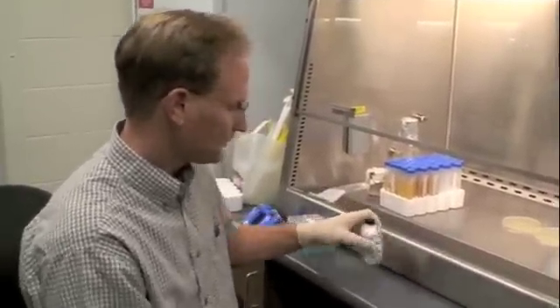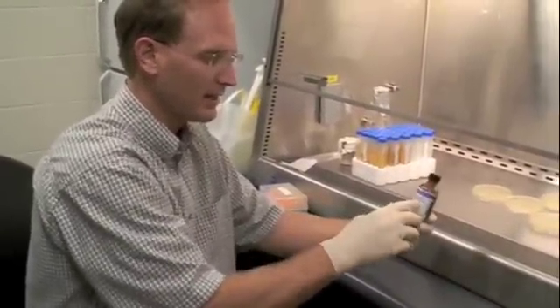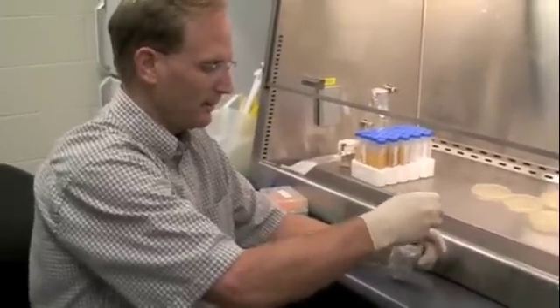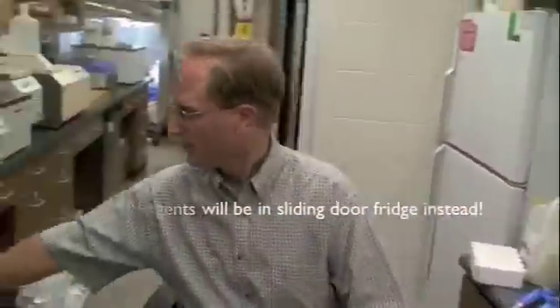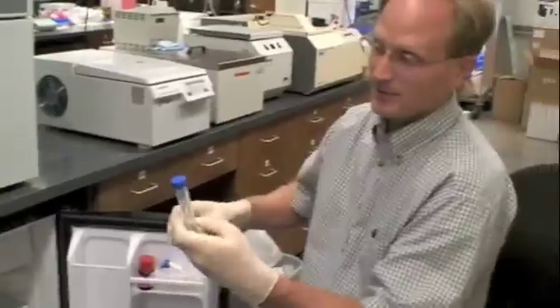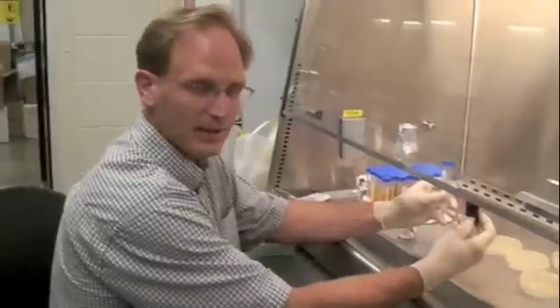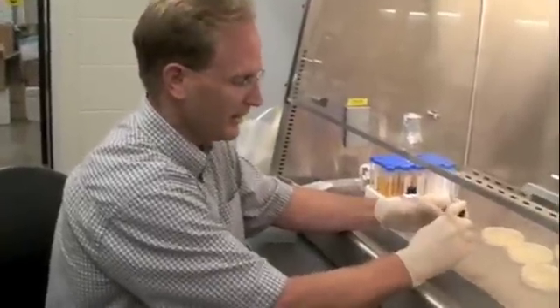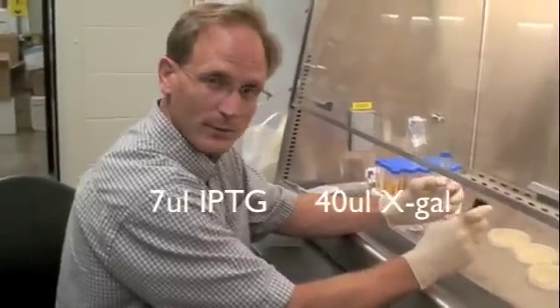What we use for that is IPTG and X-GAL — they're two different chemicals, although occasionally we've purchased a combined solution of X-GAL and IPTG, or they are separate. There is a fridge right here by the cloning area with a little freezer on top. Inside the refrigerator there is some IPTG at 20% and also some X-GAL. Today we're going to use both systems. We need 7 microliters of IPTG and 40 microliters of X-GAL.